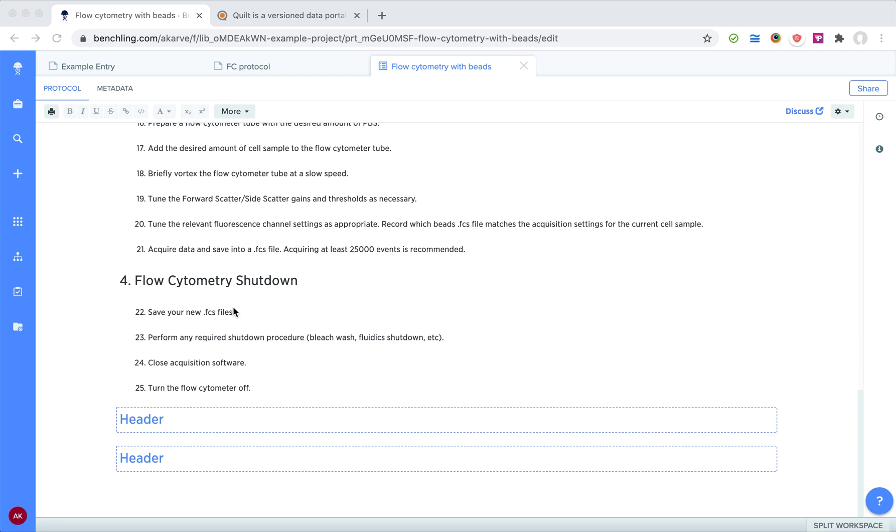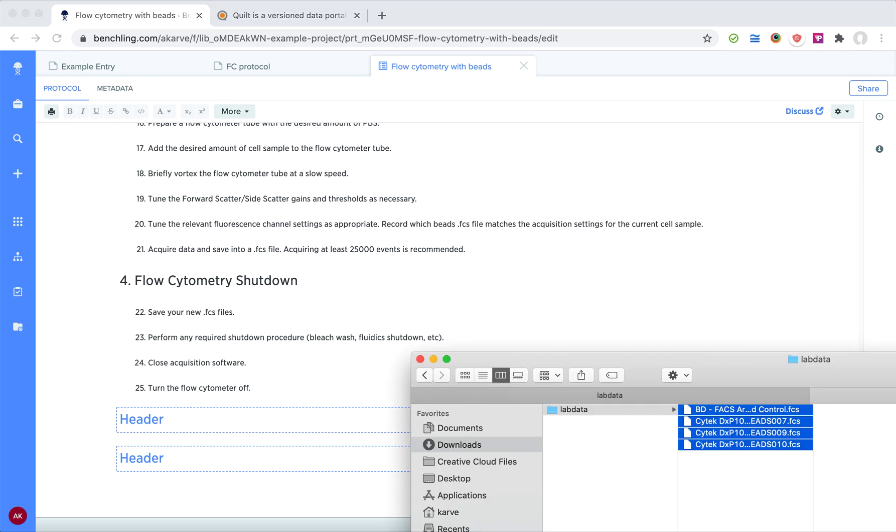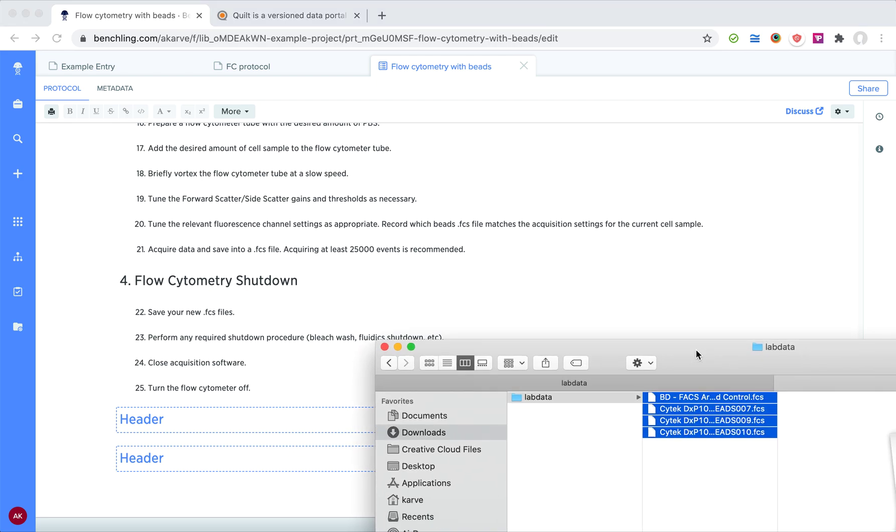Okay, I've just completed a flow cytometry with beads protocol and I'm in Benchling here on step 22. It's saved my new FCS files, but I don't just want to save them on my laptop where they're going to get lost or potentially deleted. I want to store them in the cloud where my colleagues can find and build on my work, and where I can build on my work a month or two or three months, or maybe even a year down the road.